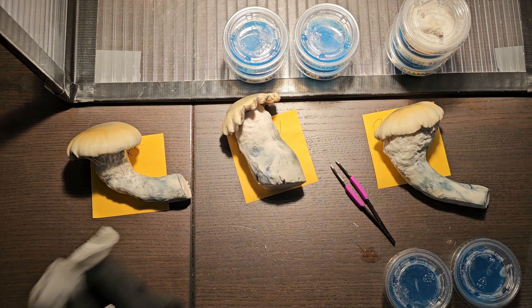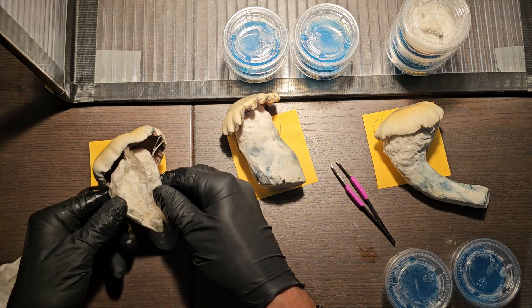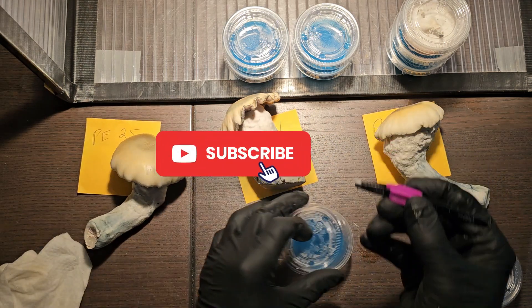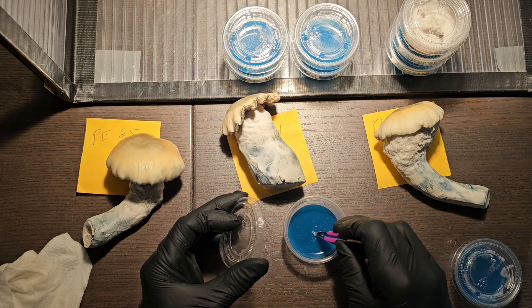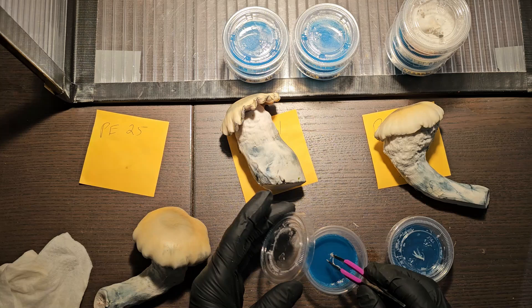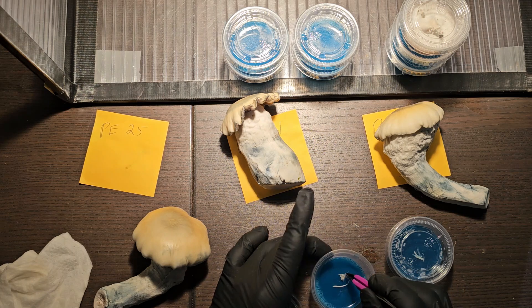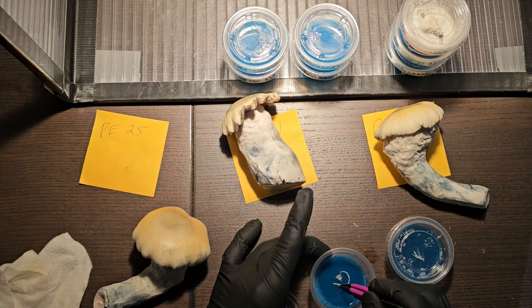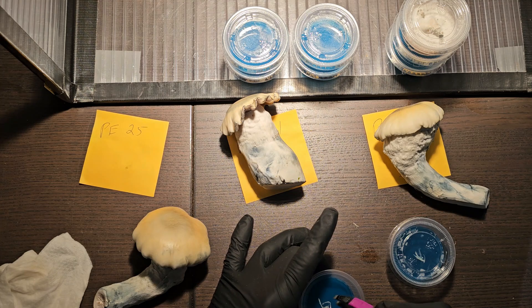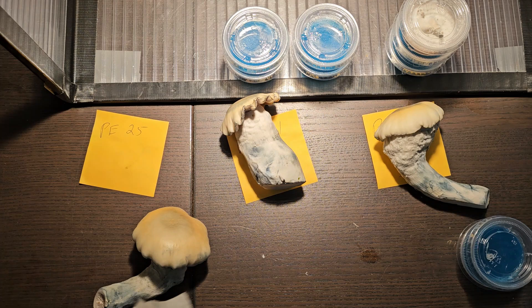I've already sterilized all these cups. First I'm going to go for this guy — I'm calling him PE 25. I'm just going to break right into the middle there and grab out that fresh tissue. Grab out one more. This is going to give me the specific DNA of this actual mushroom, and the next batch should hopefully grow much like it — or even larger. I had to touch it with my finger so I'll sterilize quick, even though it's the same strain.